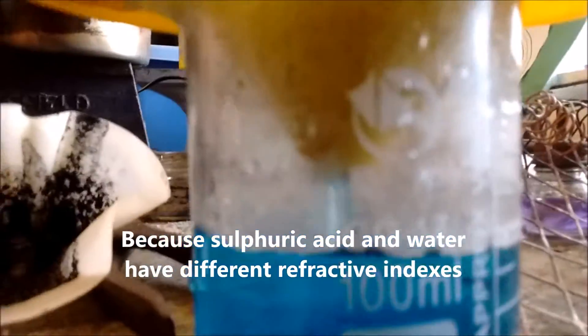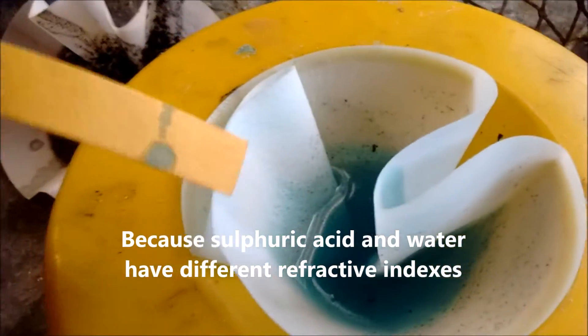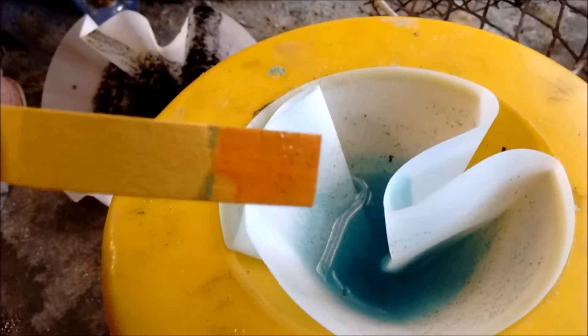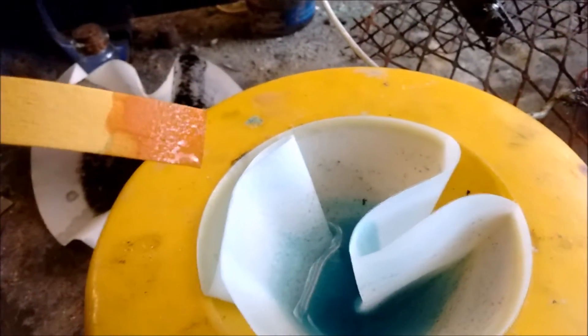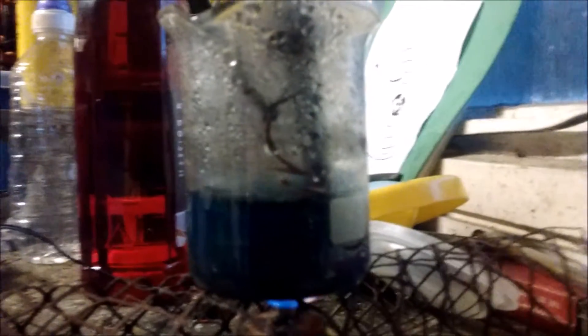The other test, of course, would be to get some universal indicator paper. And yeah, that is quite red — it's an acid. So it's really, really dark now. It's been going for a couple of hours, so it's probably not that much longer.